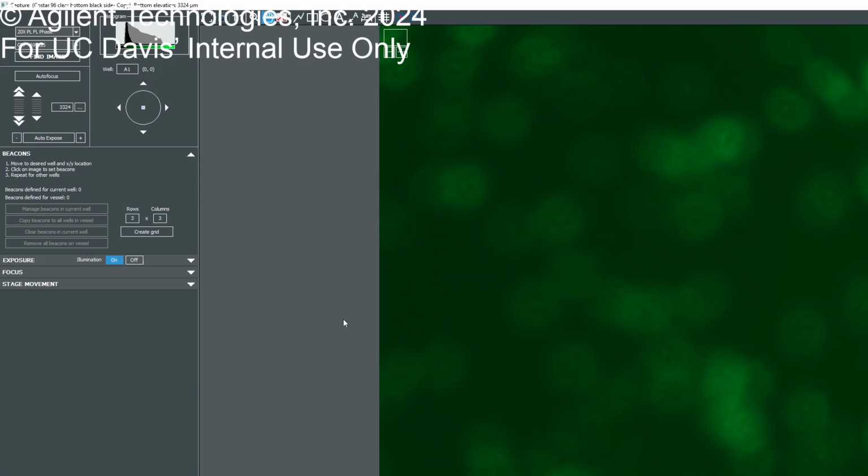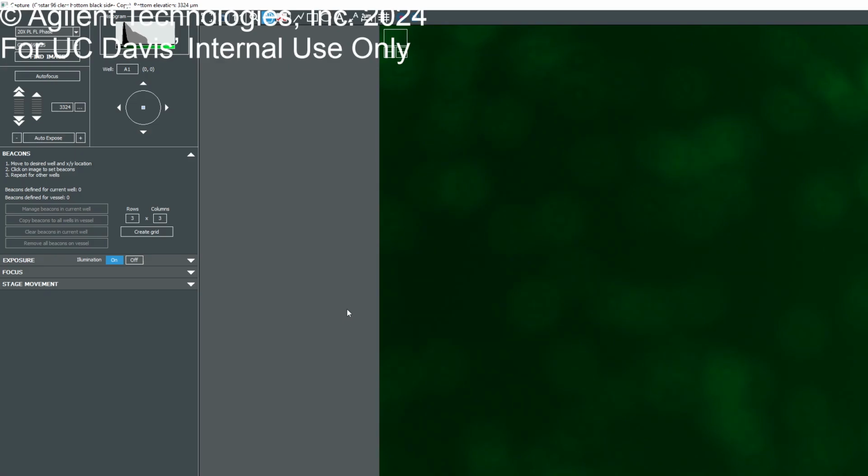So you have relatively less resolution, but it also speeds things up because it doesn't need to gather that much information. It's going to deplete the image quality slightly, but give you much faster data, and the file sizes are going to be smaller. So basically, people use that in a high throughput environment to make everything faster. That's the only purpose.